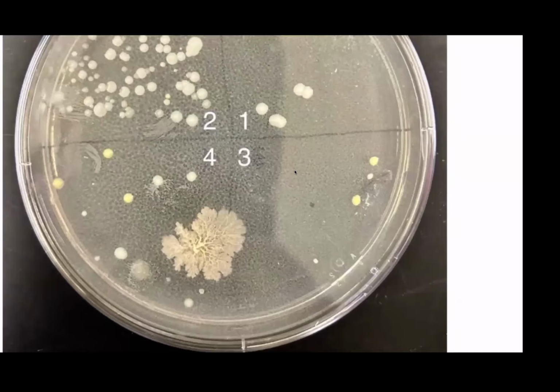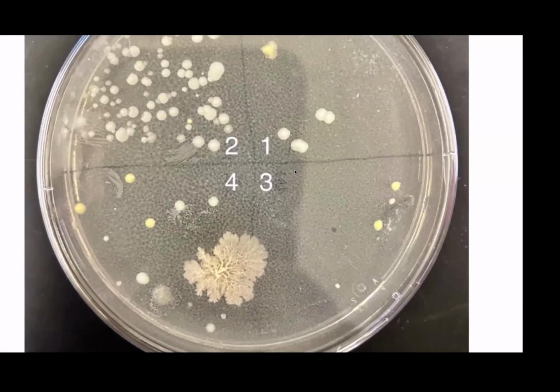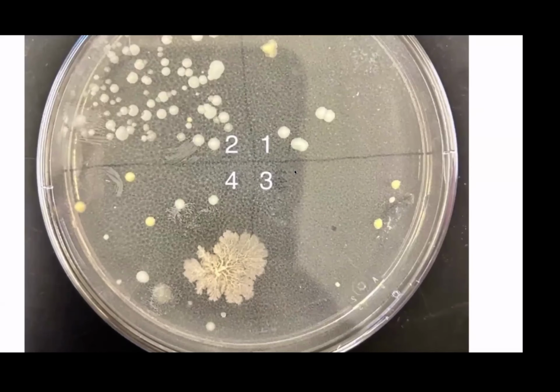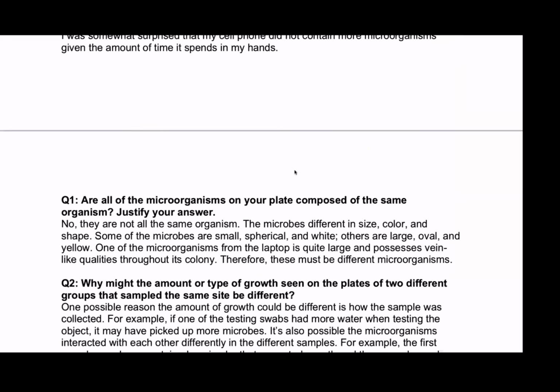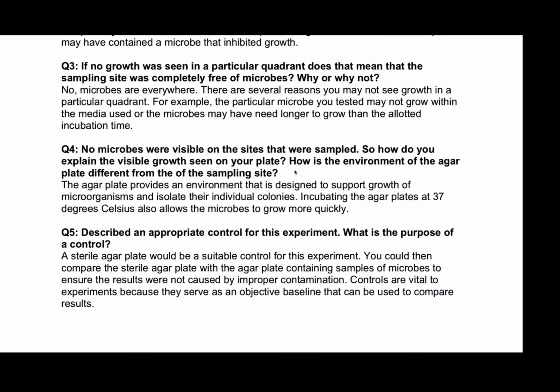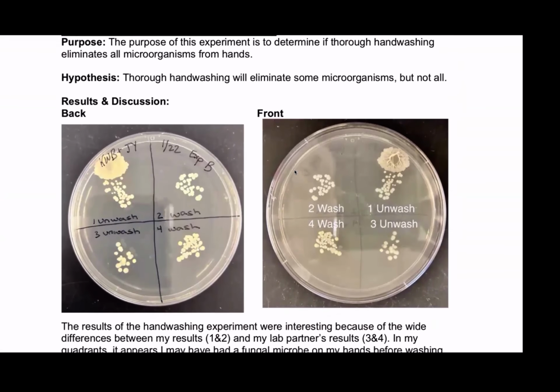Similarly, on the other plate, it's the same plate, but you can see from the back side or the front side, there is some moisture here. So you can compare the morphology of these cultures, and you can find out that these are different bacterial species. So they have to answer all the questions. You guys are also doing an awesome job.